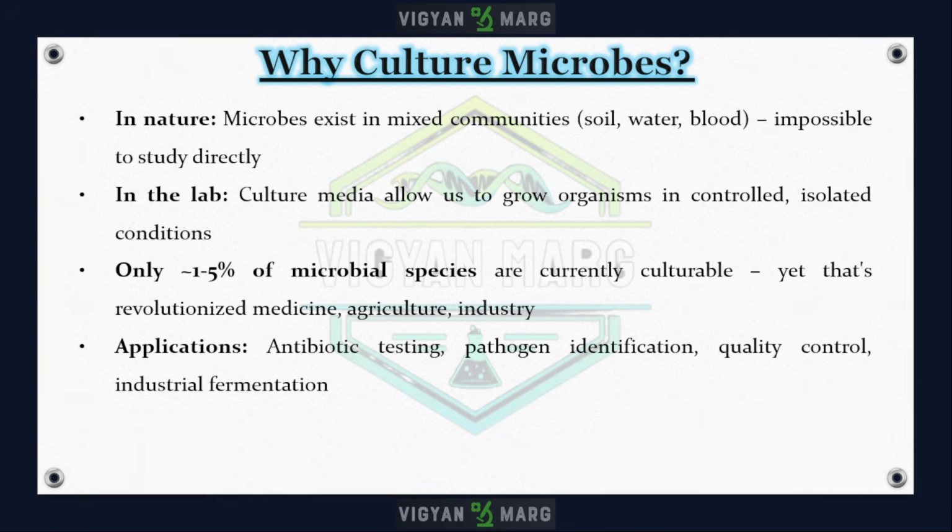In nature, microorganisms almost never live alone. They are part of complex mixed communities in soil, water, blood, the human respiratory tract, the human gut, and so on. Studying them directly in such mixed environments is extremely difficult because many species are present simultaneously and interact in a complicated way.